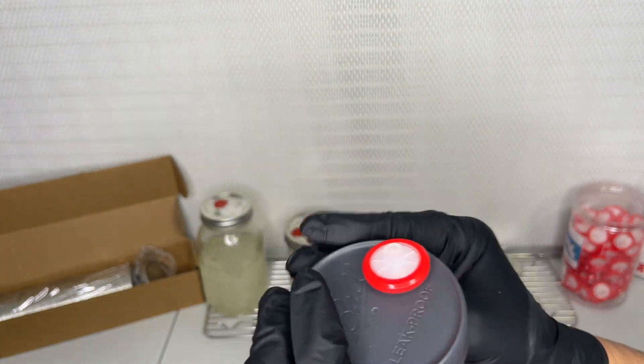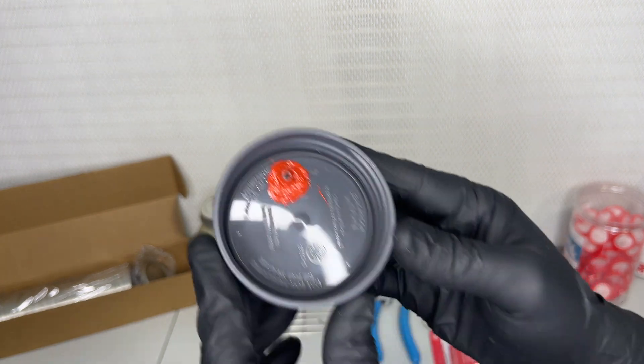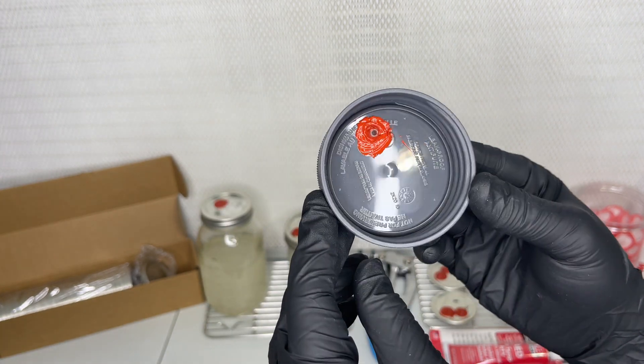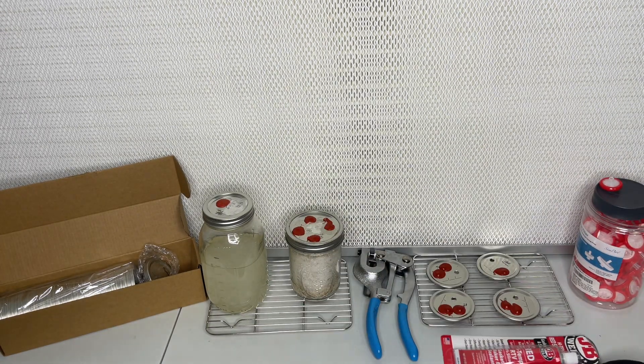I usually use two layers of micropore tape to cover the fresh air exchange hole, but you can use these synthetic filter discs as well. They're hydrophobic, so that means the water won't soak into the filter.